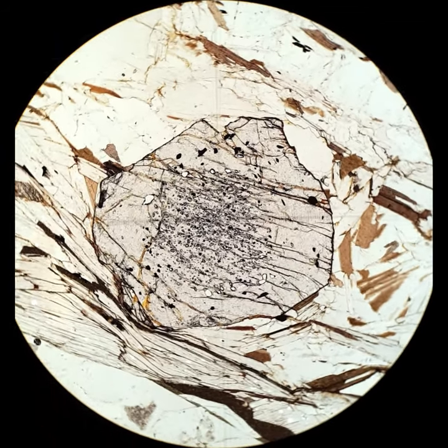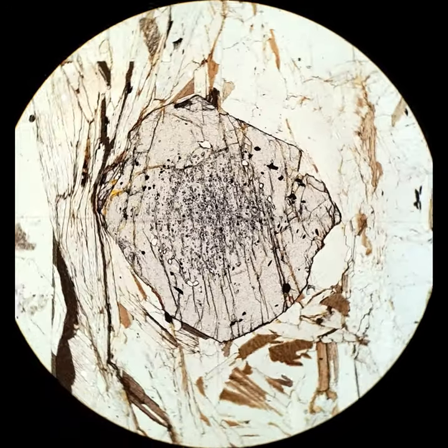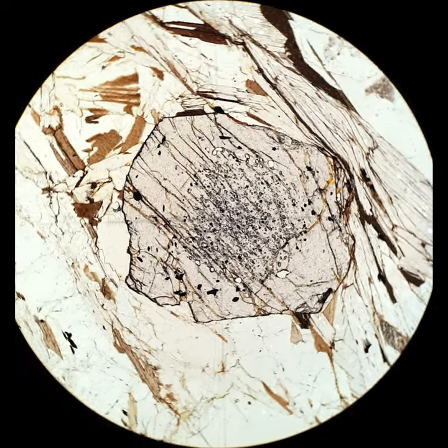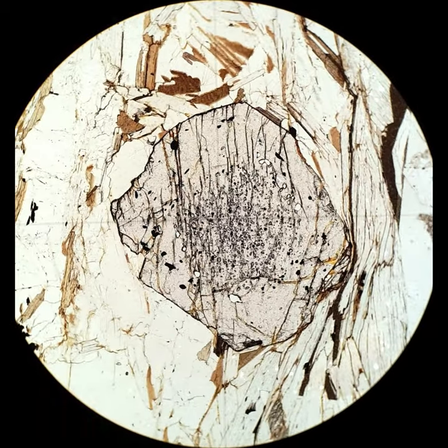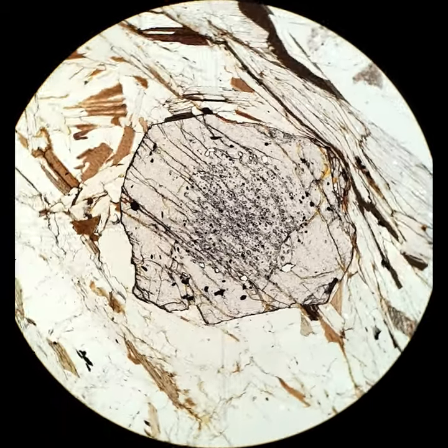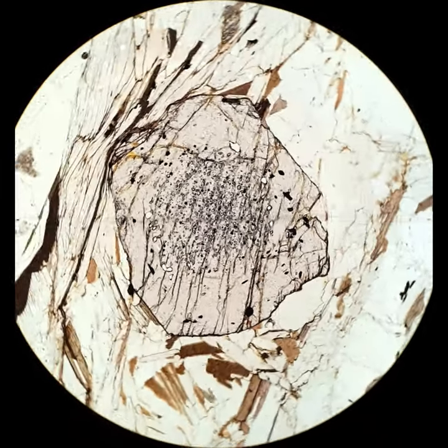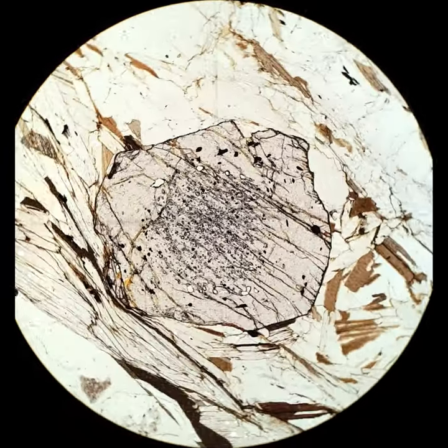It's important to distinguish color zoning from textural zoning. Here's a garnet that has more inclusions in the core than on the rim. That doesn't mean it's chemically zoned — it could be, but mostly what you're seeing is a textural zonation, not a color or chemical zonation.